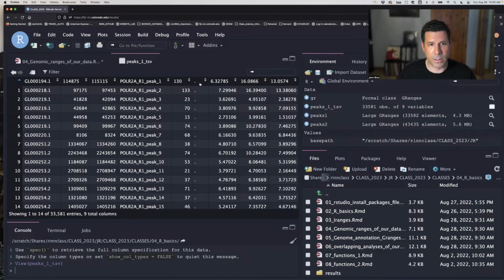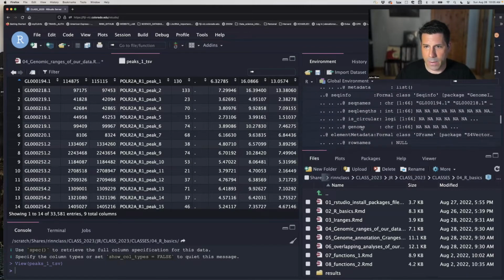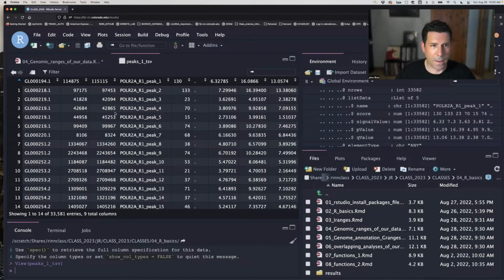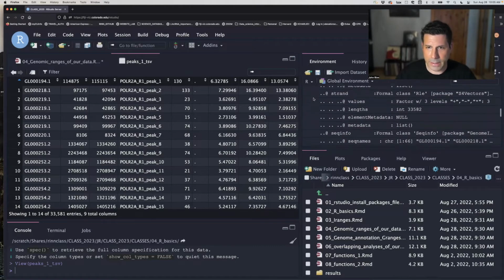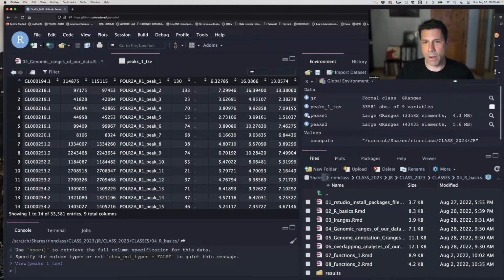These black regions are not actually in the data frame, they're the column names. So that is all basically being stored in peaks here, right here in the list data. It's going to have the same sort of values as this data frame. Okay, and it gets confusing for a while, but then you realize how handy all that information actually is.